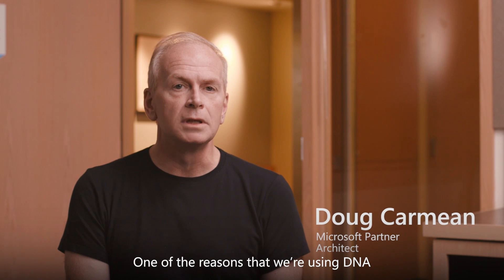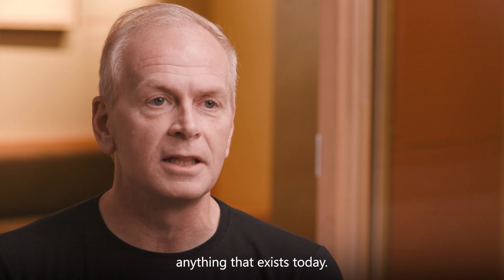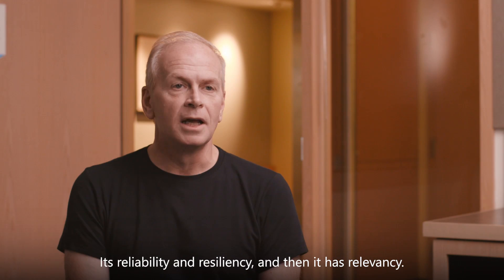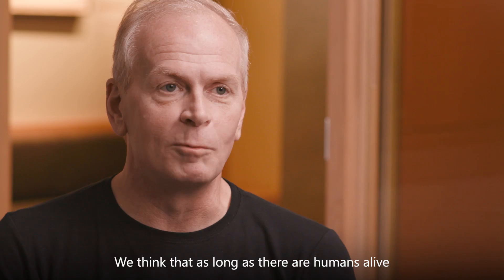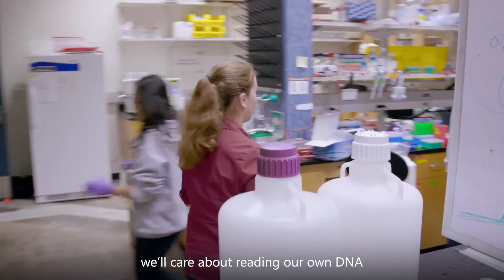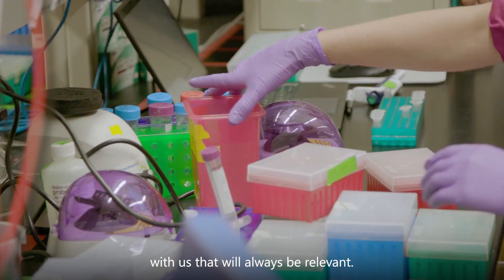One of the reasons that we're using DNA is its density is orders of magnitude higher than anything that exists today, its reliability and resiliency, and then it has relevancy. We think that as long as there are humans alive, we'll care about reading our own DNA. That means that we'll have a storage format that will always be relevant.